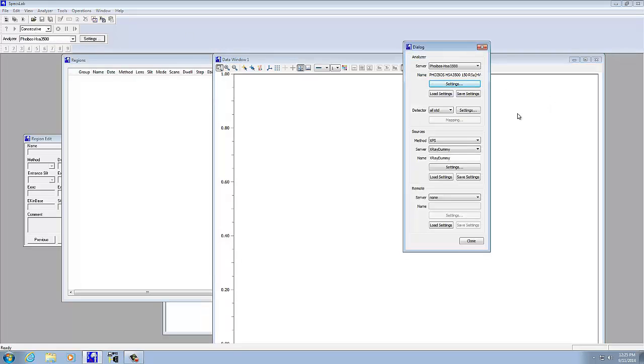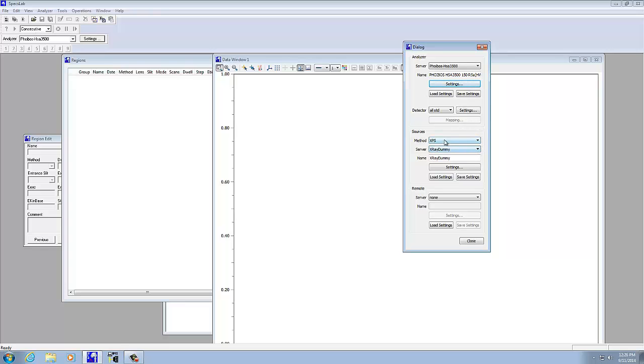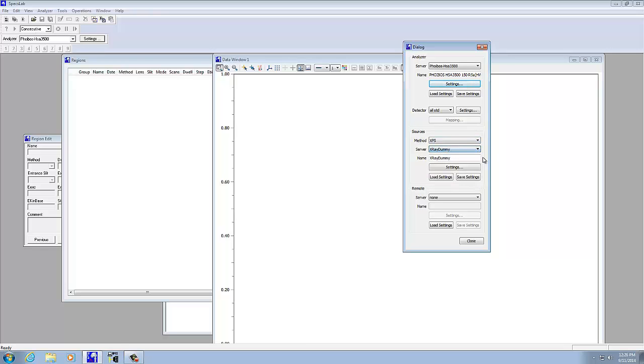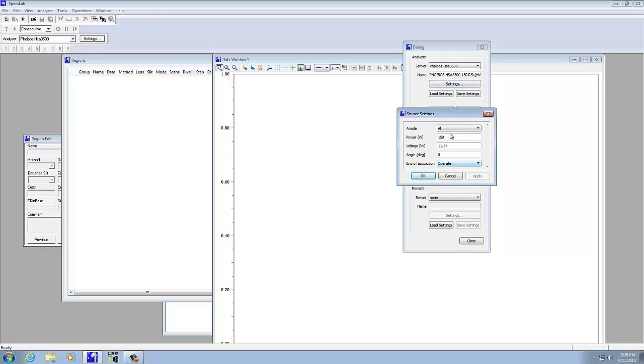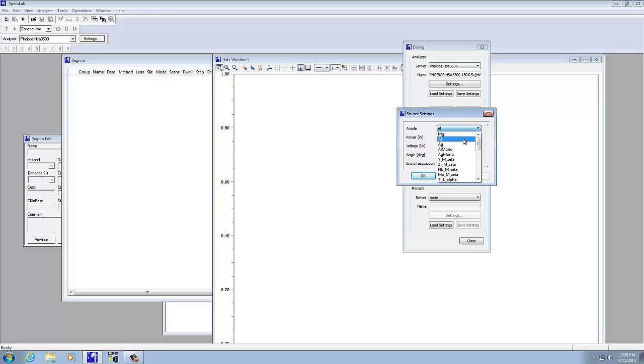Check the settings here. On the actual power supply, you'll determine which anode you're using. Make sure that the analyzer understands which anode is being used. That's found here in the sources under X-ray dummy. If we look at settings, in this case it's the aluminum, and that's what I have selected on the actual power supply. We can change that to magnesium if you're using the magnesium source instead.